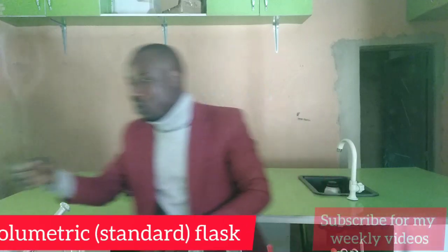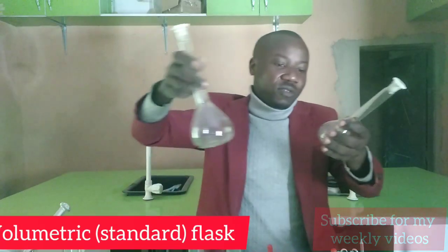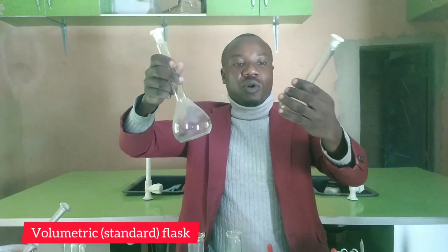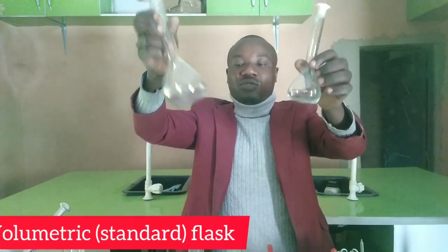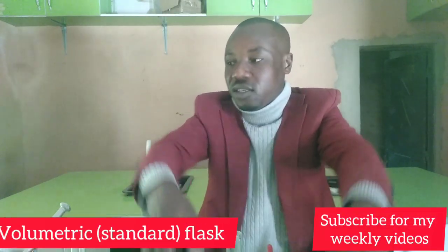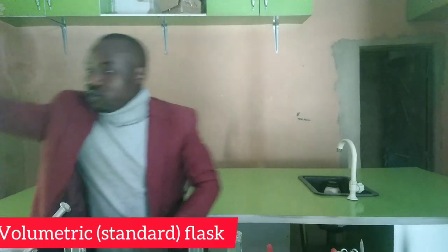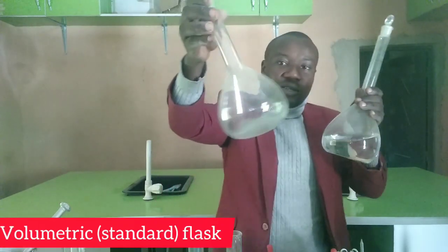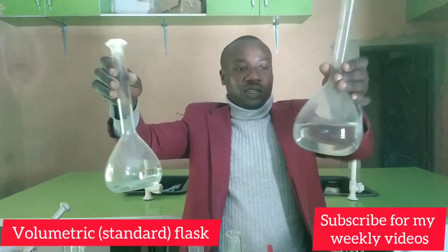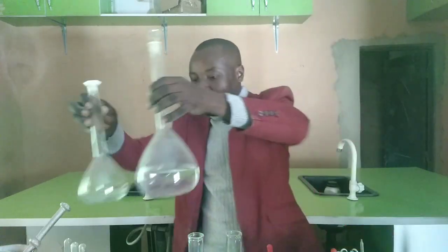The next one I'll be showing you is the volumetric flask, which has different sizes as well. This one is 100 ml. The white one is 250 ml, made of glass. This is another one of a different size, 500 ml, while this one is 1000 ml.